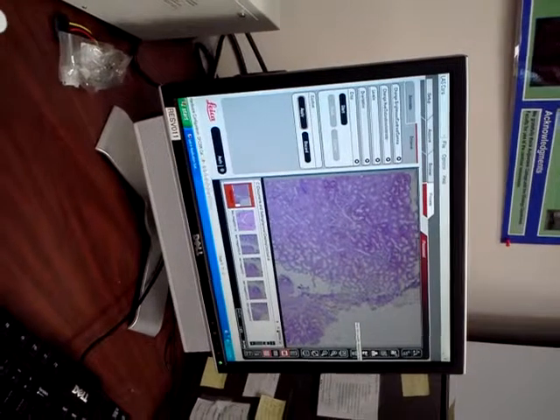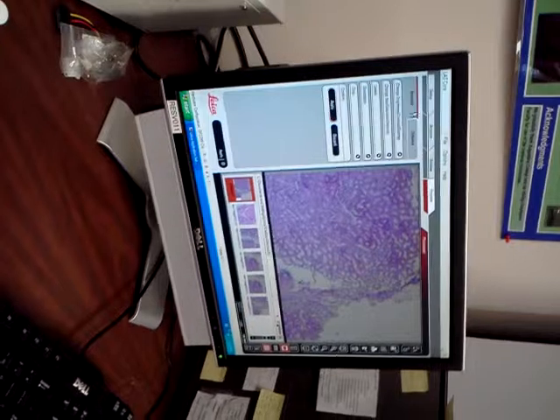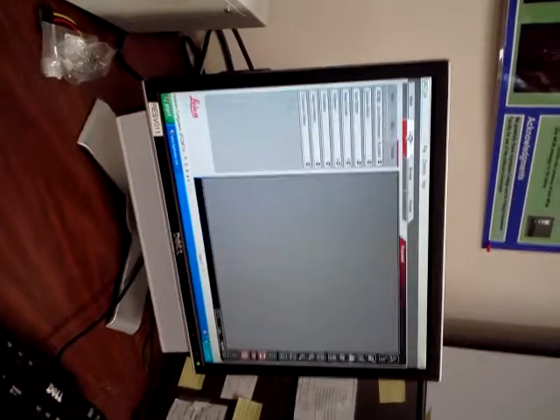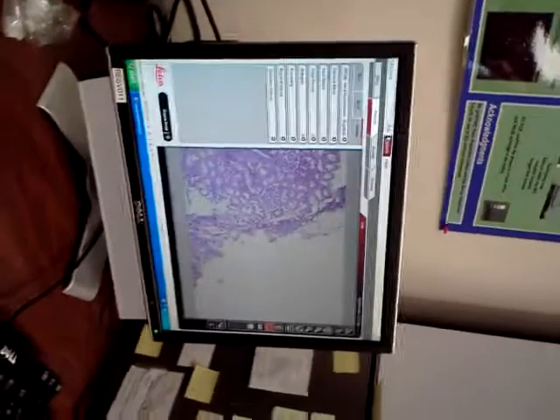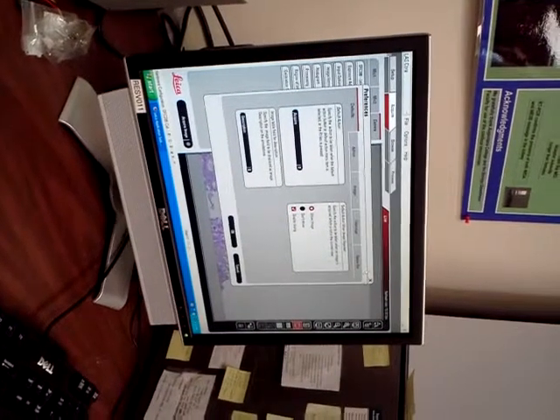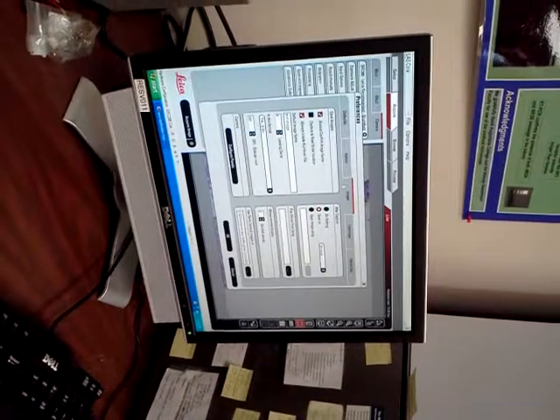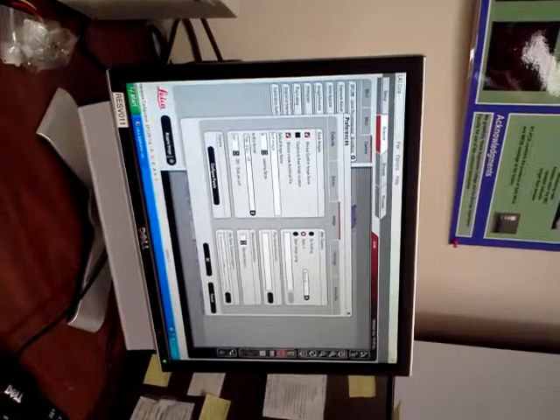It looks like very simple software once you're sitting down with it for a while. And there's some carryover with other software that we use. This isn't a world different than other acquisition packages. It's got the same sorts of settings. And even in options, so options, preferences, image is the one area you can go to. And you can change some things.